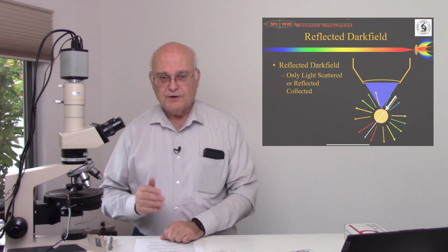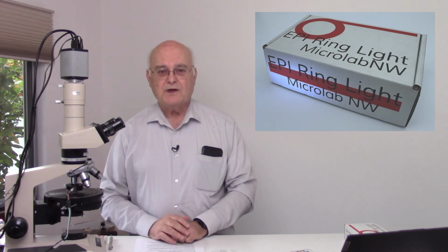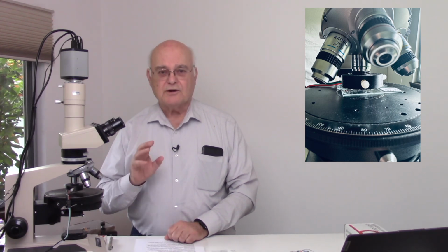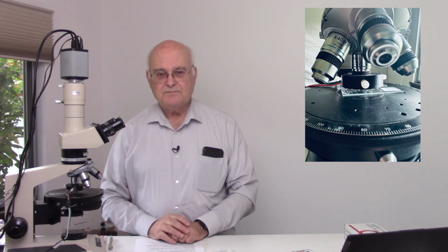Episcopic dark field illumination shows you the reflectivity of the particle. This reflectivity only occurs on exposure to elevated temperatures. It can be used in coal analysis to identify wildfire debris in the coal bed.